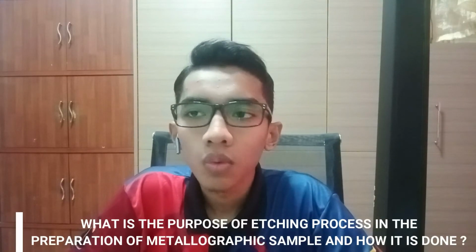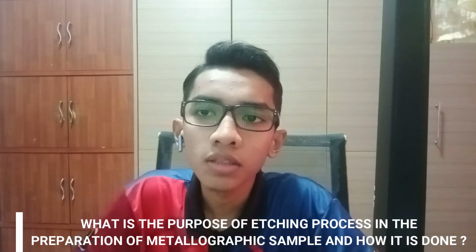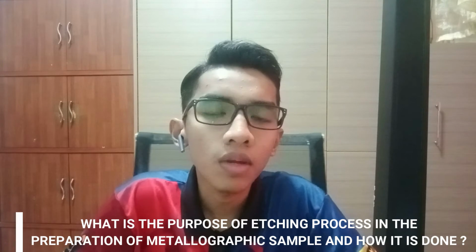So after making the video, the discussion of the experiment. The first question is: what is the purpose of the etching process in the preparation of the metallographic sample and how is it done? So my answer is metallographic etching is the process of revealing microstructure detail that will otherwise not be evident on the as-polished sample. The process is done as follows.